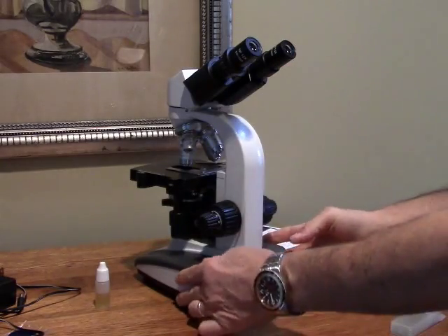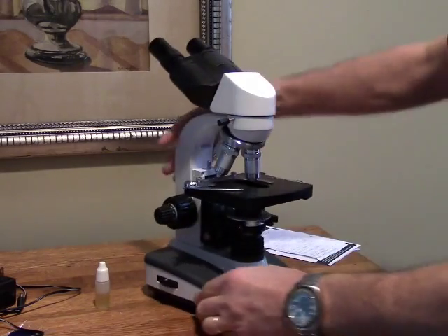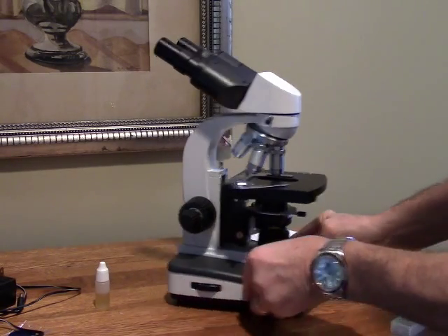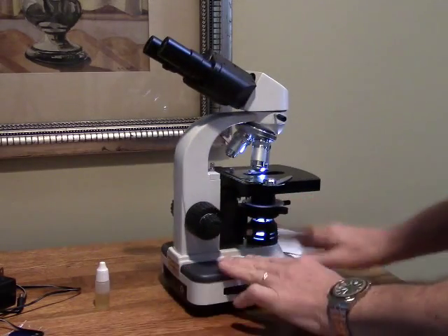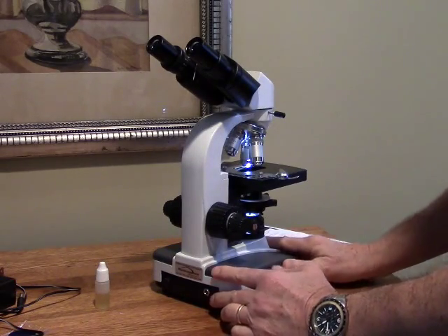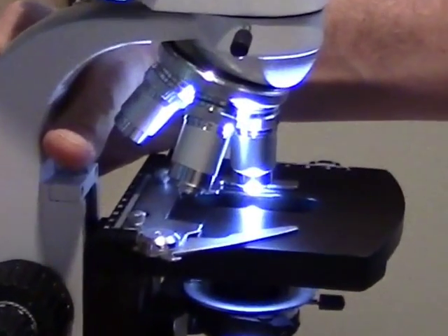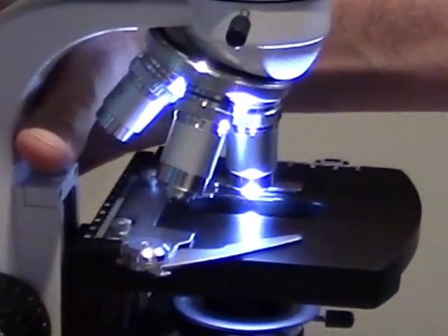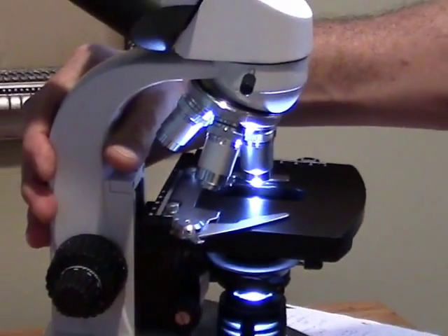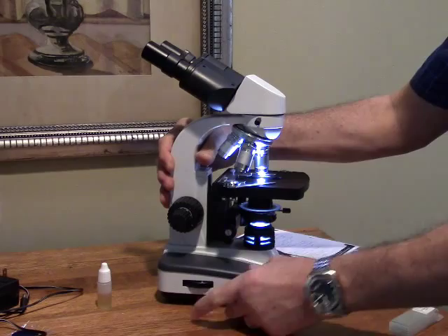It does have the rechargeable LED illumination with adjustable brightness controlled by this knob over here. With one charge — which only takes about a half an hour — this will give you a full day's worth of illumination, which means you can take this out in the field with you. I did notice that when adjusting the brightness at higher ranges it does flicker during adjustment, though once you set your brightness it doesn't flicker. Not a deal breaker, but something worth noting.